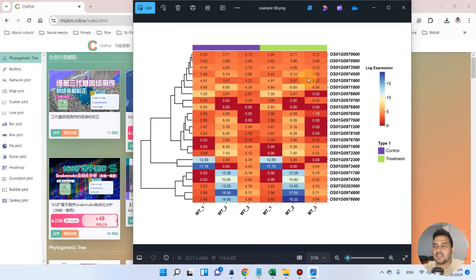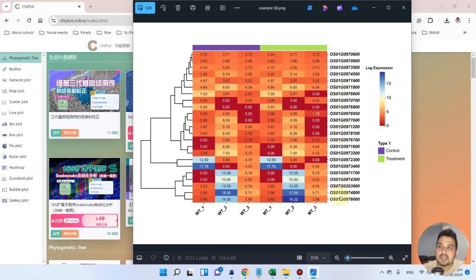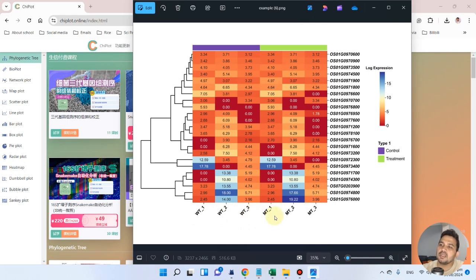Welcome to another video tutorial. In this video I will show you how we can draw a heat map using the ChiPlot website. This heat map is really attractive and can be used for quality publication purposes. On the y-axis we have the gene names, and on the x-axis we have the names of samples — three samples from wild type and three samples from mutant type.